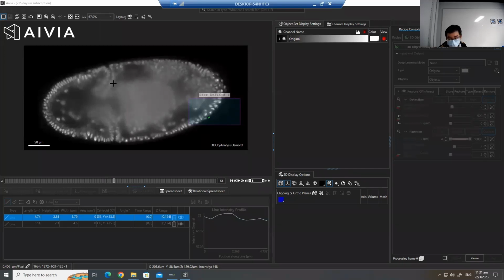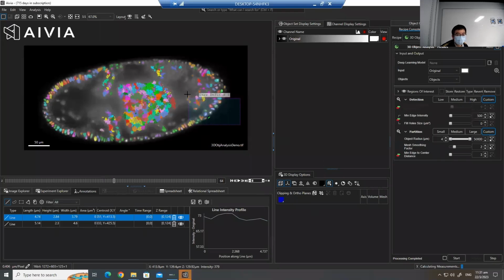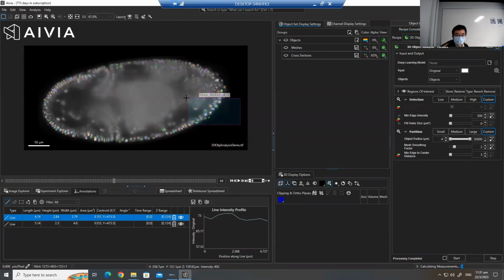I was totally dependent on the CPU. Maybe next time we use the ROI. Yes, but just ignore this one. I will turn this off and then go to the preview again to turn it off. So if you click this one, you generate the preview with these settings.